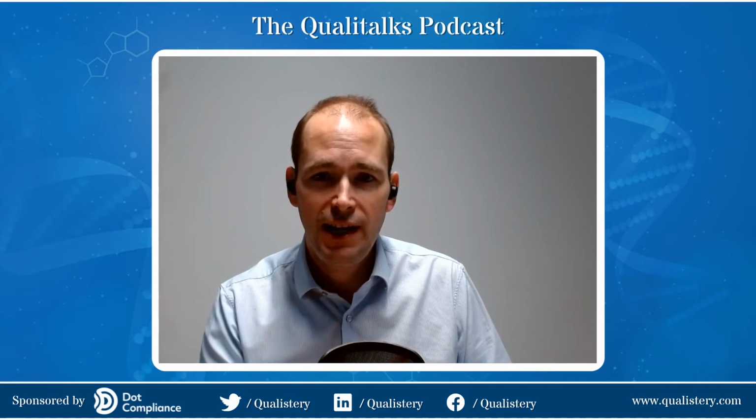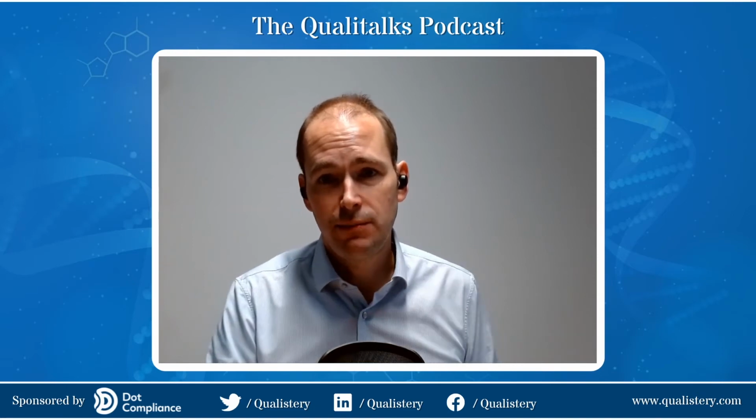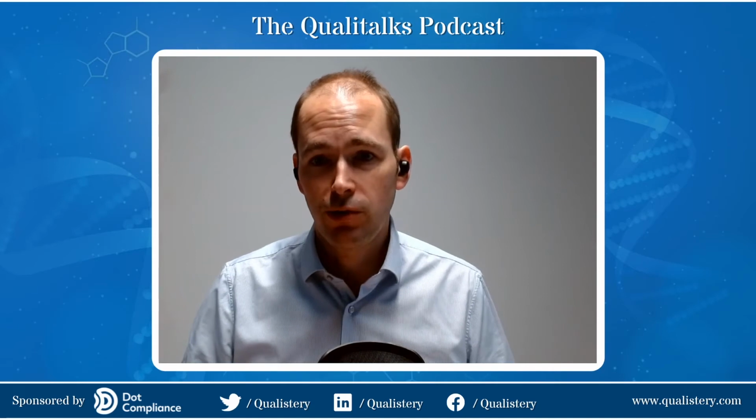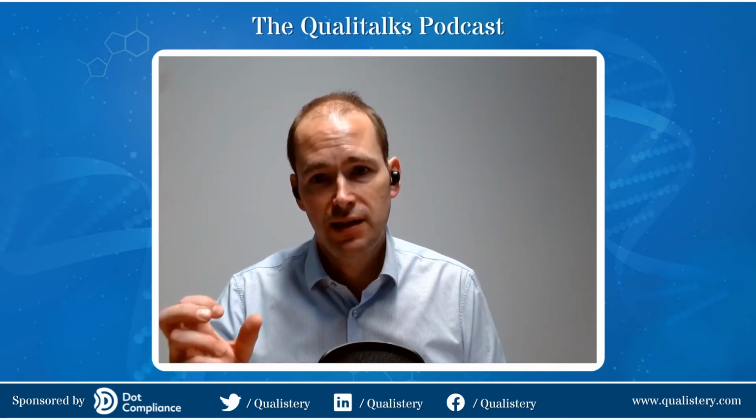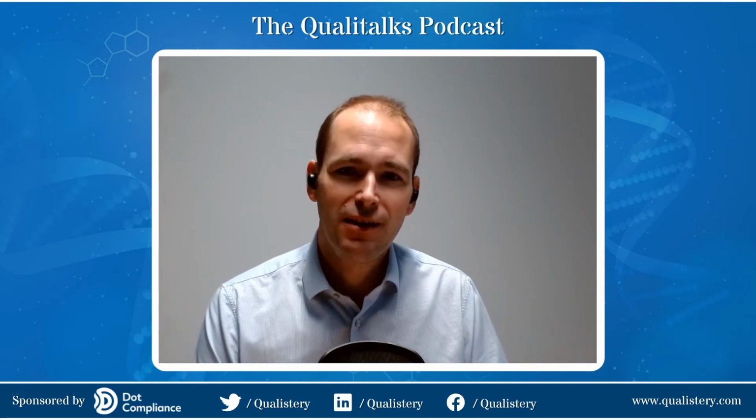So if it's dry heat, it takes a lot longer to kill. If you've had any experience of working with depyrogenation tunnels, they operate at a higher temperature, generally for longer periods of time than the steam sterilizer. So we might be at 300 degrees rather than 121 degrees. And it's really because moist heat kills a lot faster than dry heat. So high temperature in an autoclave is not always a good thing.